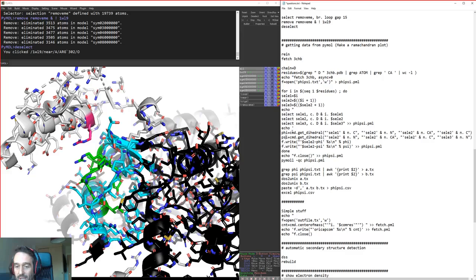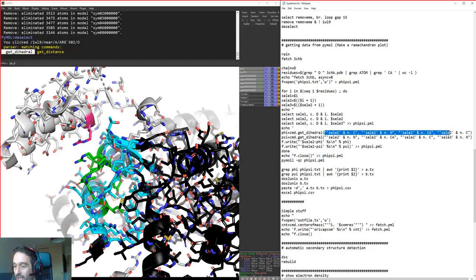going to use these commands called get dihedral. So you can actually type get dihedral straight into PyMOL here. You can see it here, get dihedral. And if you're doing a Python script, you can use the word command in order to script this, and then you make 4 atom selections. This is just using the standard selection nomenclature that we all know about.